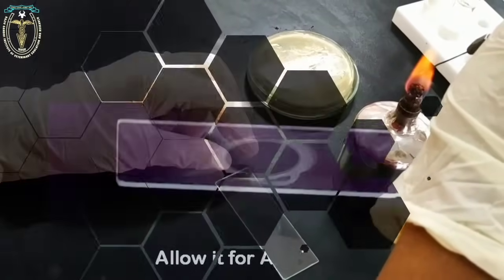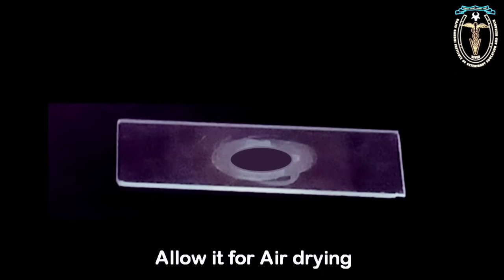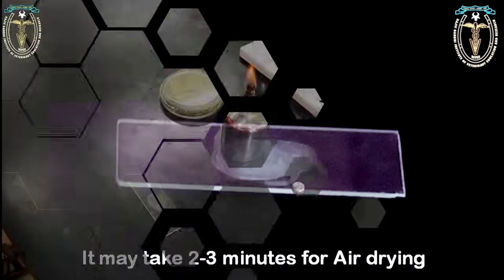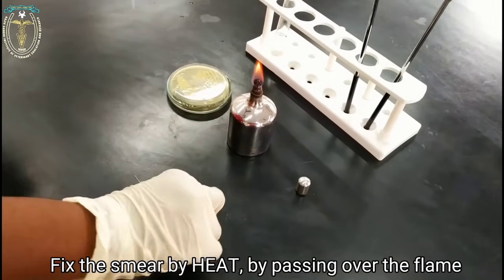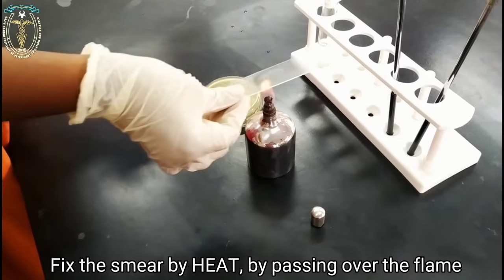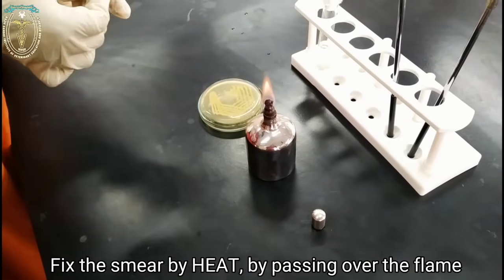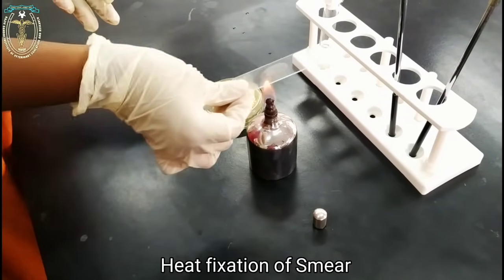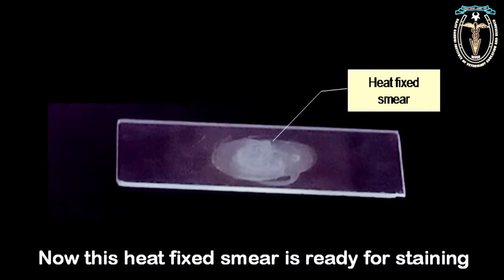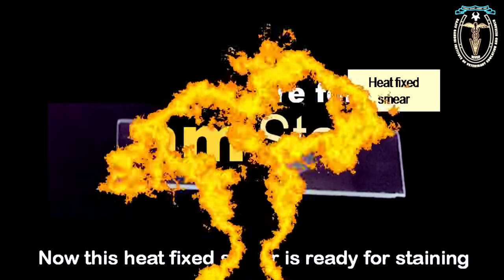After spreading, allow it to air dry. It may take 2 to 3 minutes for drying. After air drying, fix the smear by heat by passing it over the flame 2 to 3 times with a slow sweeping motion. This is called heat fixation of the smear. Now, this heat-fixed smear is ready for the staining.